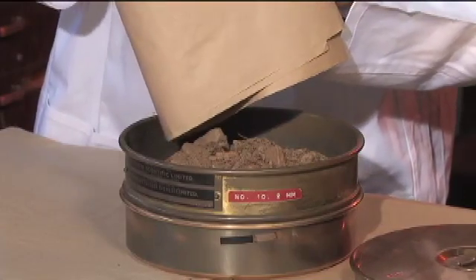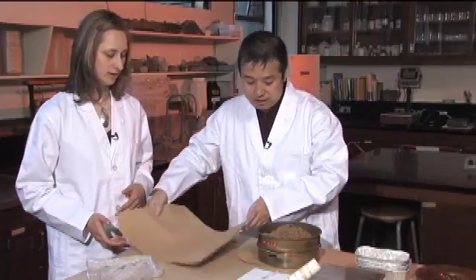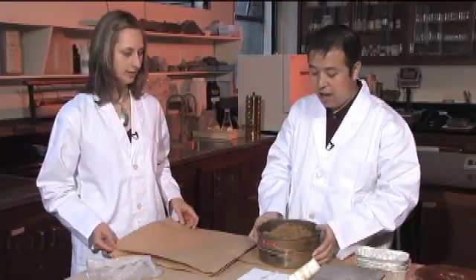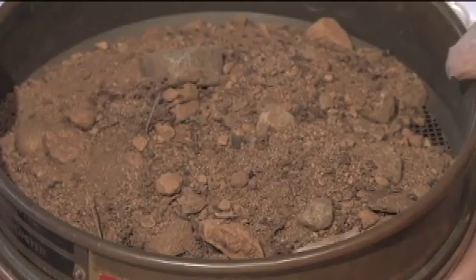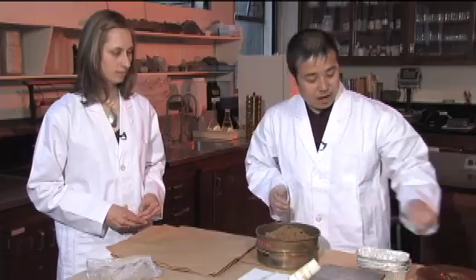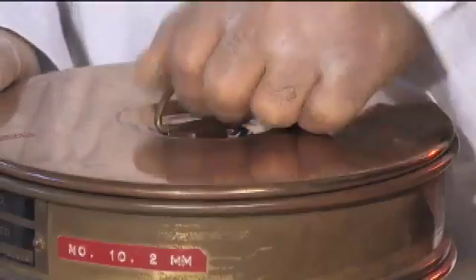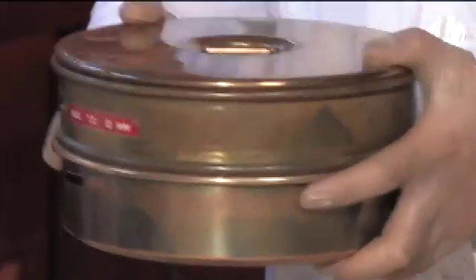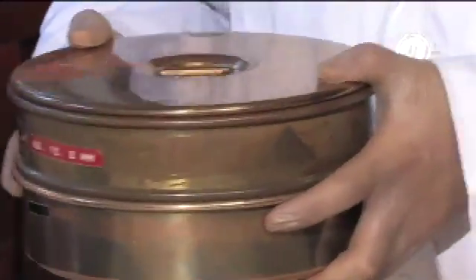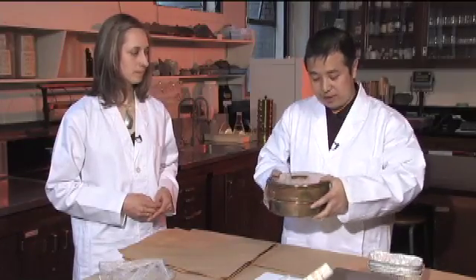Give it a little tap so everything falls into the sieve. All the dust and fine stuff is in there. The sieve is big enough to hold all the sample, so place it once, then cover with the lid and shake gently. You can also give some gentle taps on the side to make it easier for material to sieve through.